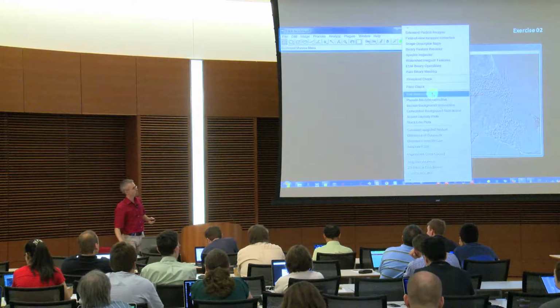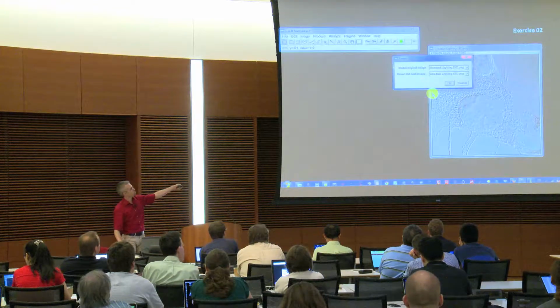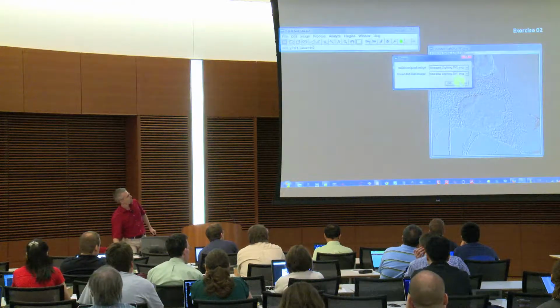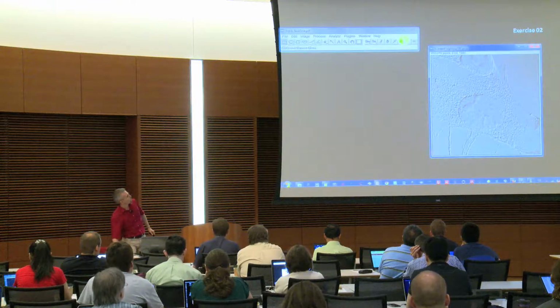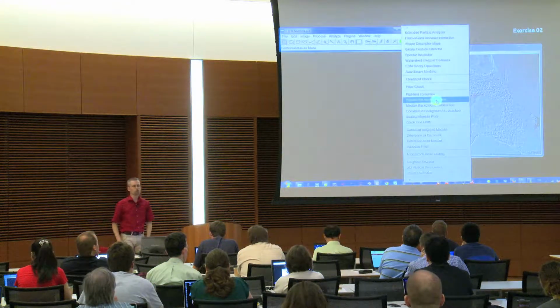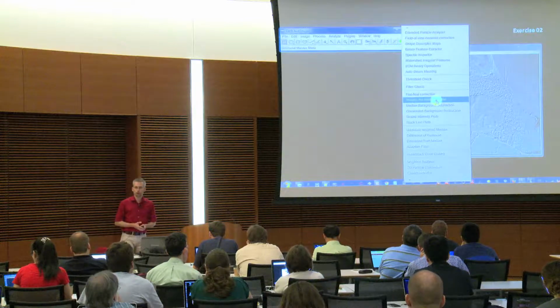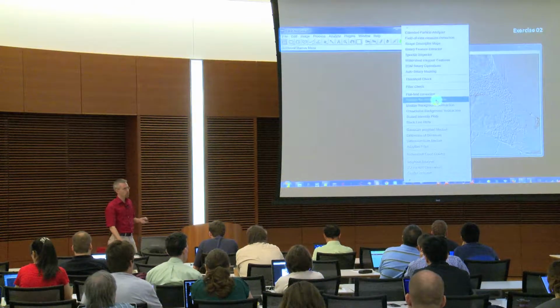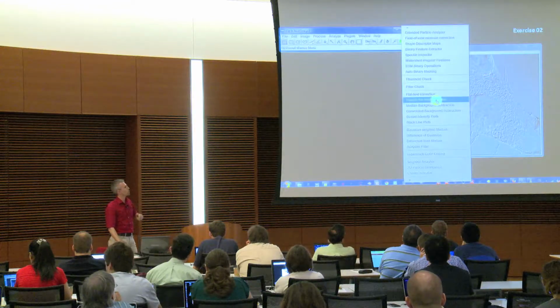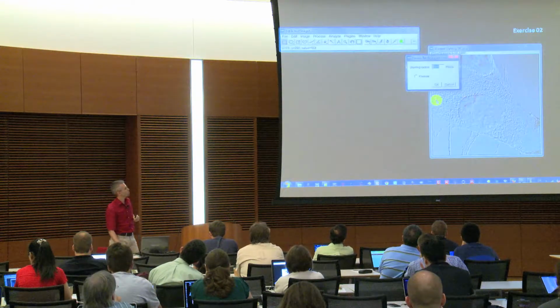I'll just show you that shortly. We are not using that. So you need to specify the two different images, original and background. The option we need to use now is actually the pseudo flat field correction. Pseudo because we create a pseudo background, which has the problem that it comes from an image which has information. So that's why it's not optimal, but it's a possibility.